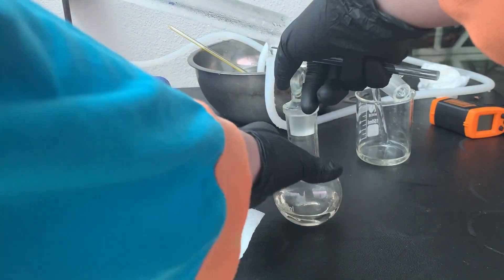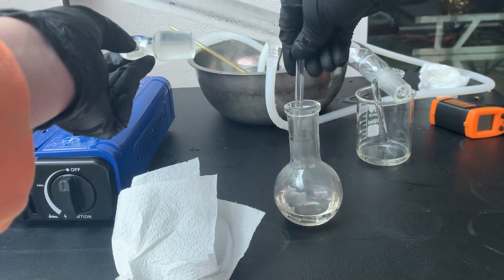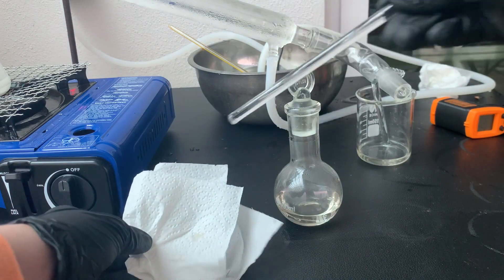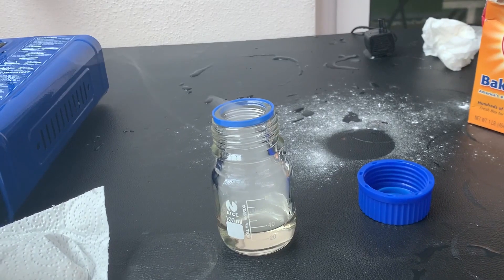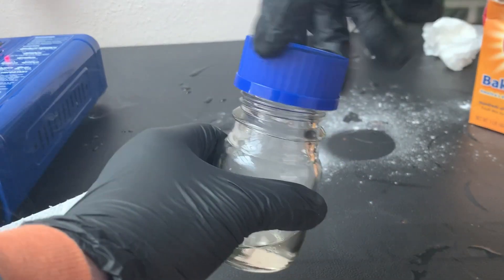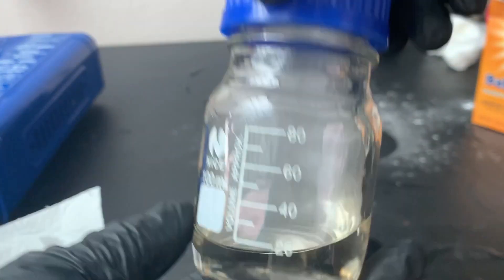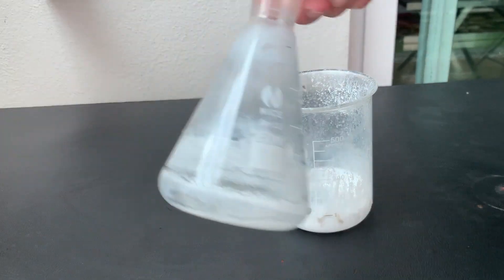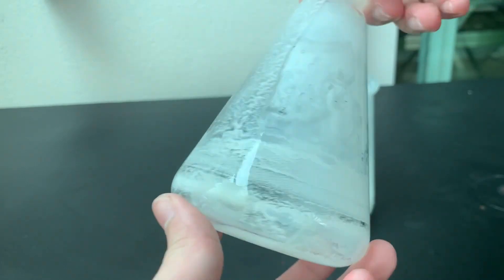Just to show how corrosive oleum is, I added a drop of oleum to a piece of paper towel. As you can see, it easily dissolves the paper towel. All of the oleum was then stored in a glass bottle. Note: heating phosphoric acid at high temperatures will etch your glass badly. The Erlenmeyer flask and beaker here will be used for oleum production.